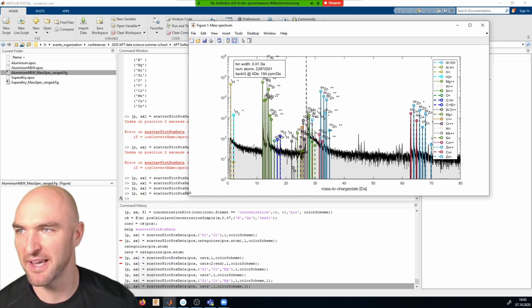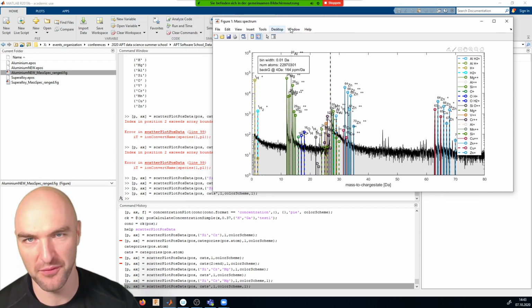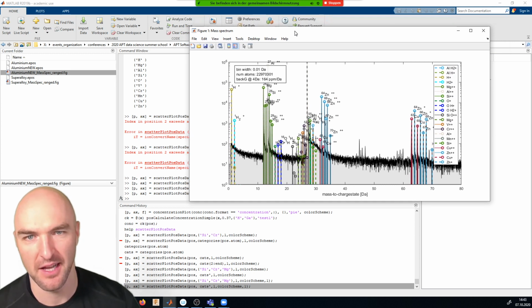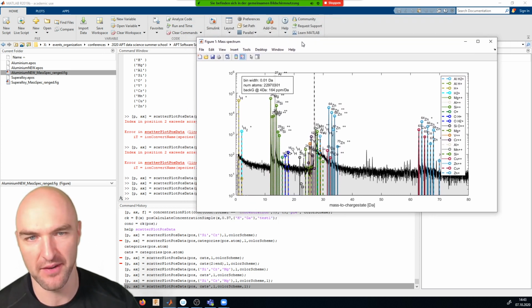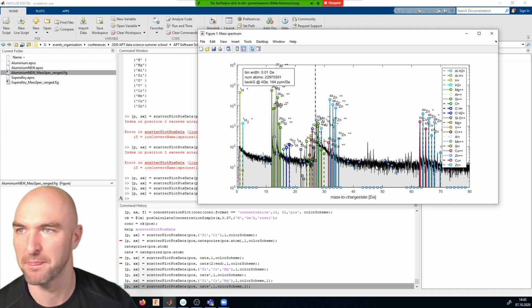So if I lost someone like Markus, then I've lost many more people. So essentially, if you reopen a mass spectrum figure, you need to have a variable that shows where the mass spectrum is, or that represents the mass spectrum. So it's a figure handle variable. This is the one that you do with the assignment of GCO, right? Exactly. Yes. But the point is, I was clicking somewhere in the figure, and obviously in the wrong place. And then I got incorrect handle references, and then of course the downstream processing broke.